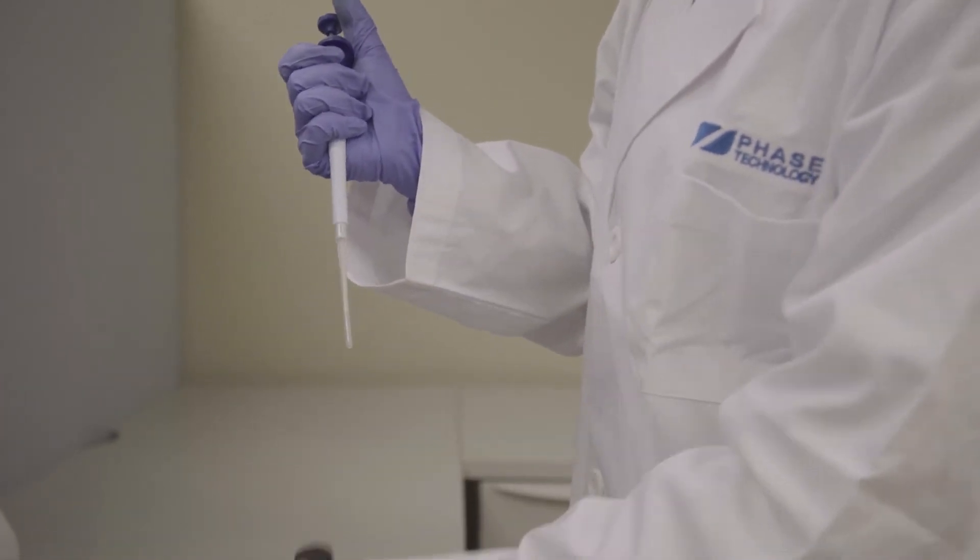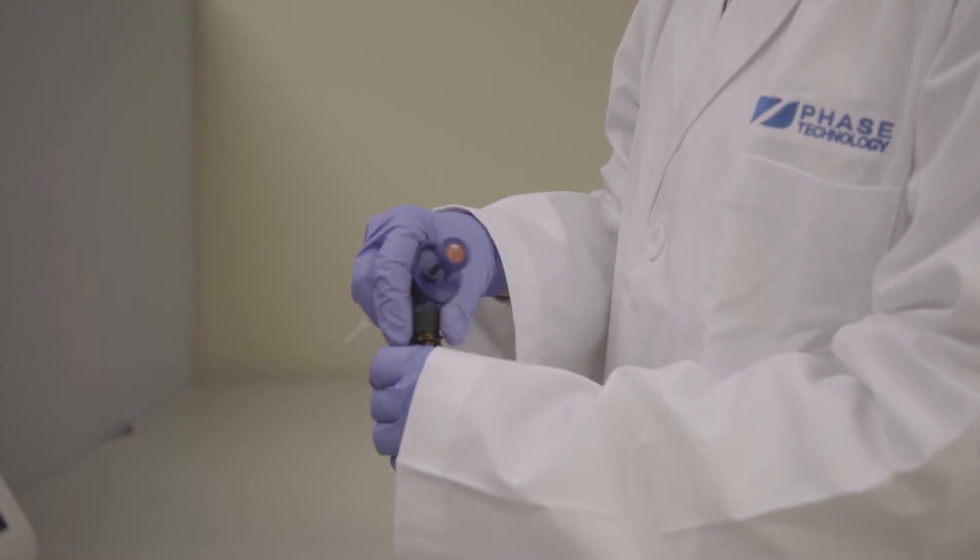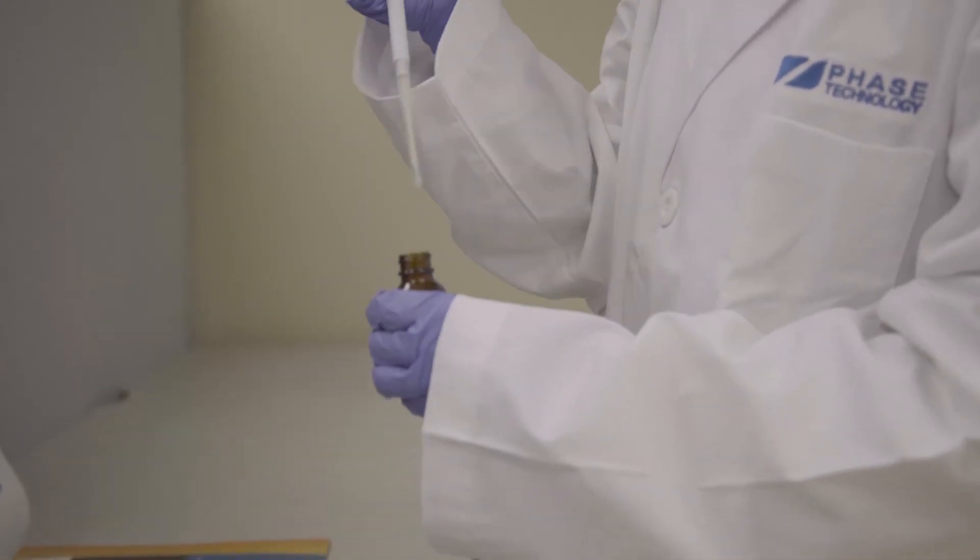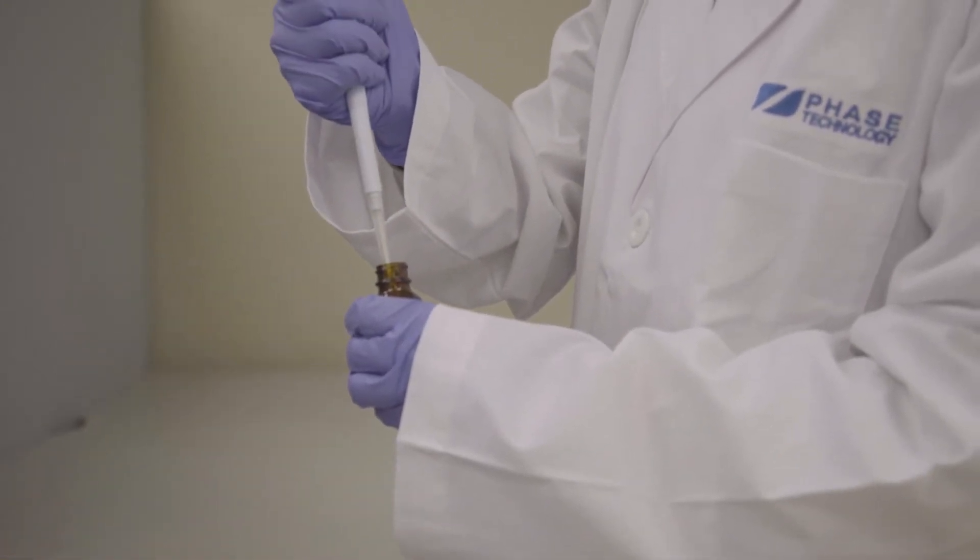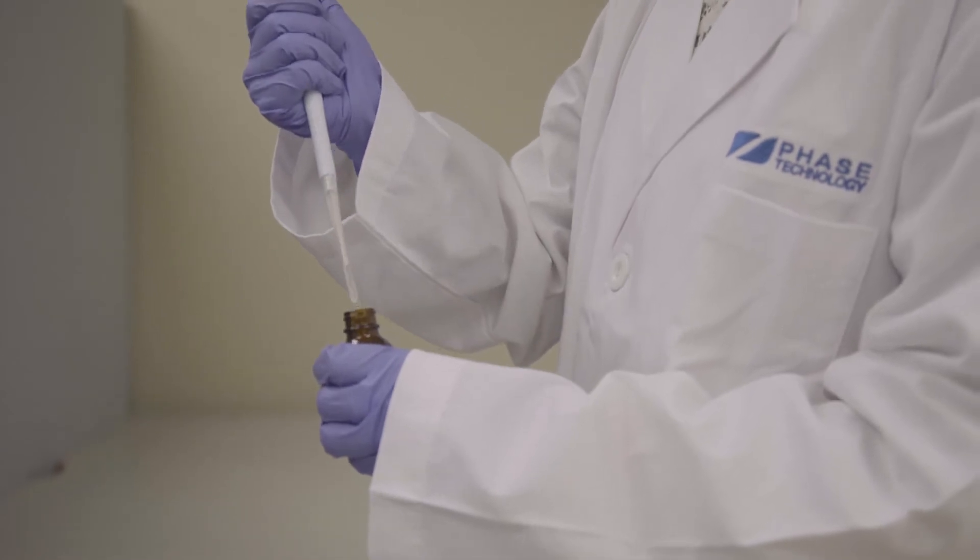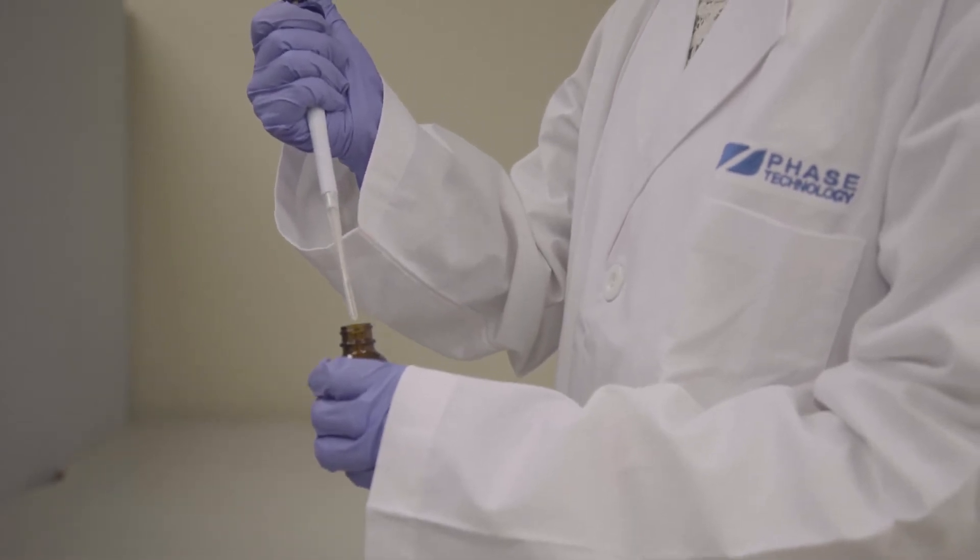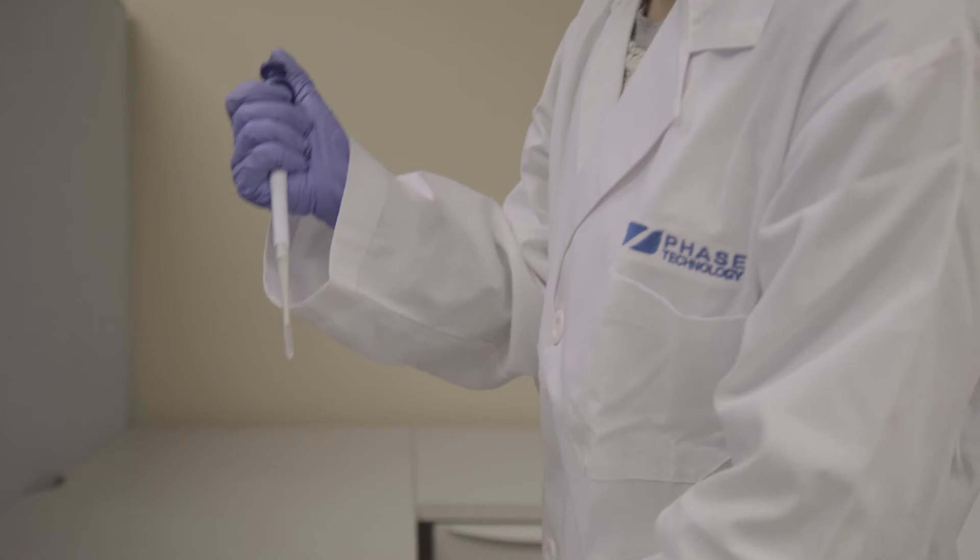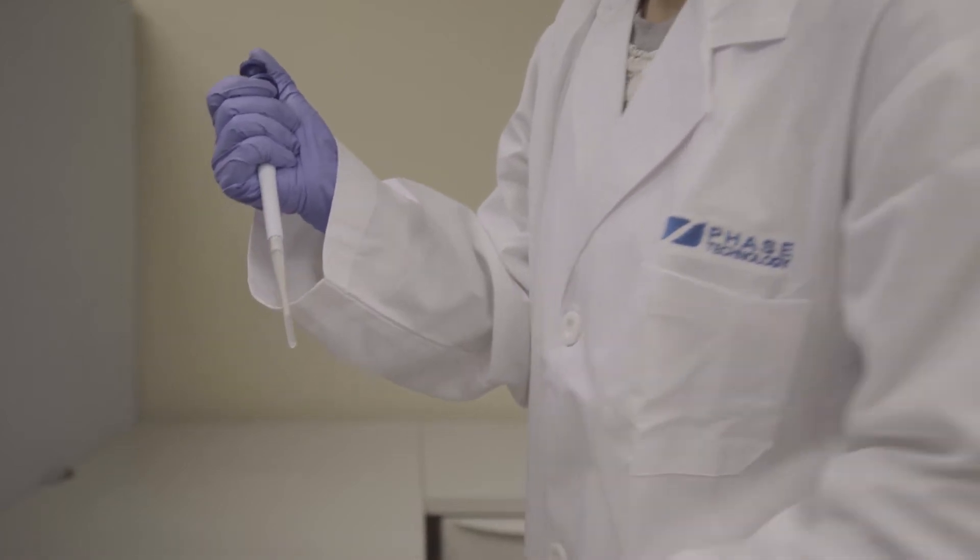Fill the pipette with 150 µL of sample by gently pressing the plunger down to the first stop. Immerse the pipette tip into the sample and slowly release the plunger to draw sample into the tip. Make sure there are no air bubbles visible on the tip.